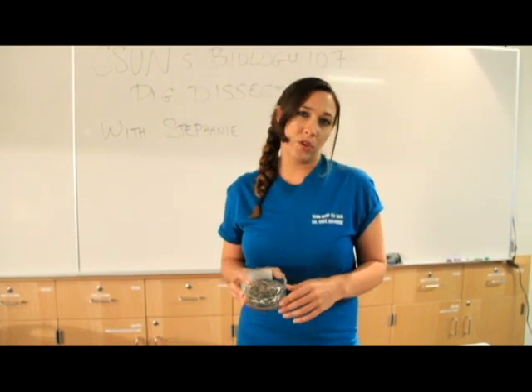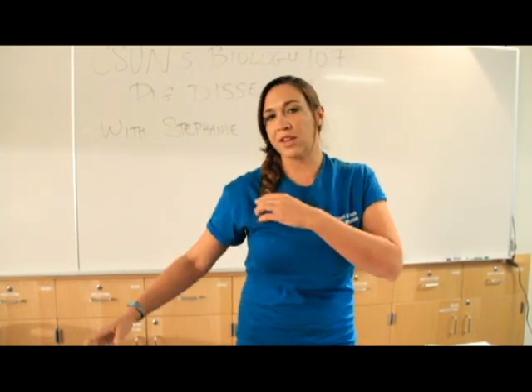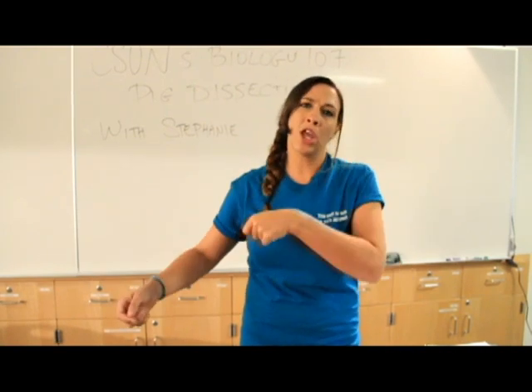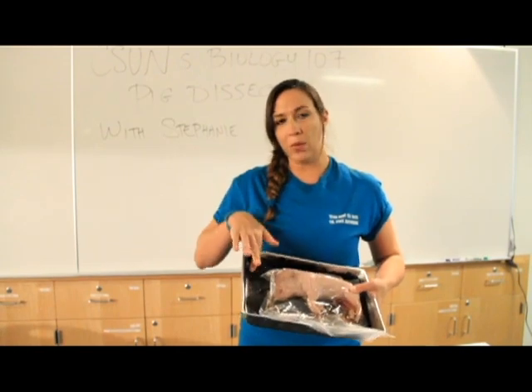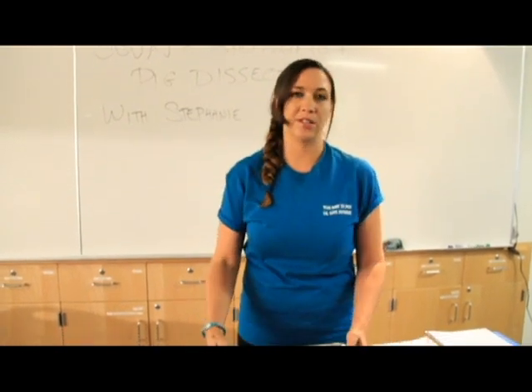These pins are useful if you ever need to pin down a part of the pig. Say his arm keeps flapping open and you want to keep it down. You can put a pin straight directly into that because our wax trays are filled with wax on the bottom, so you can stick the tools straight into the trays.